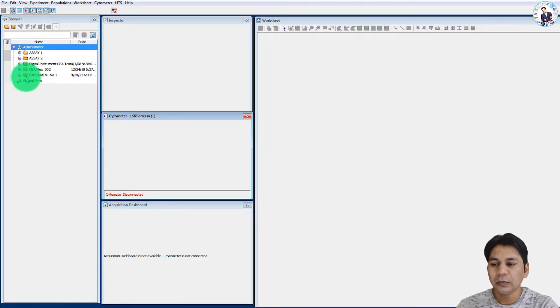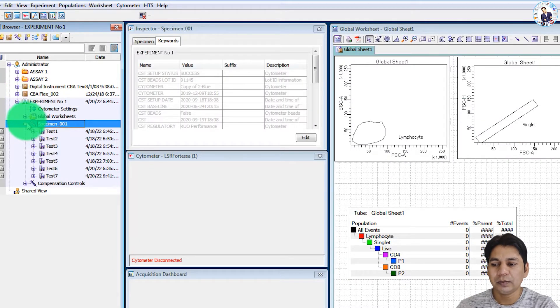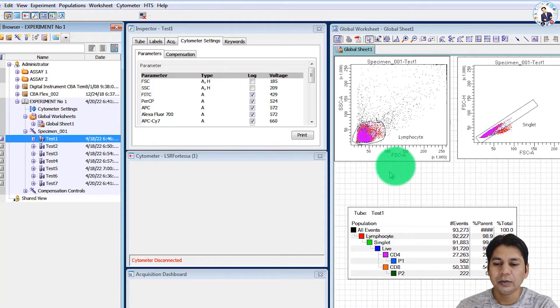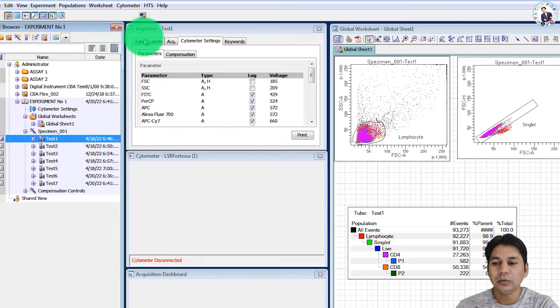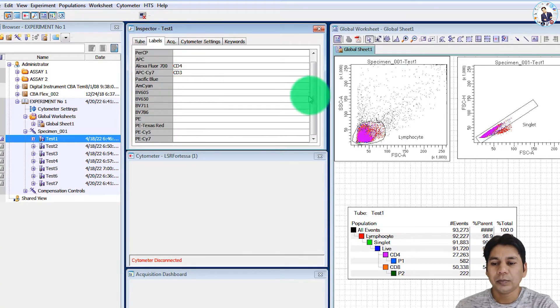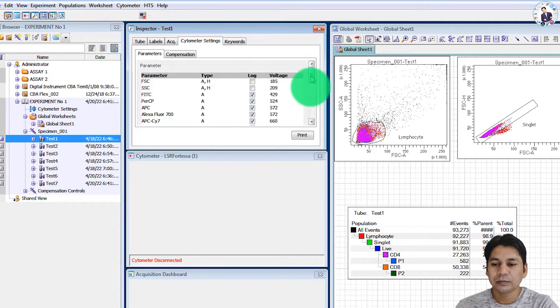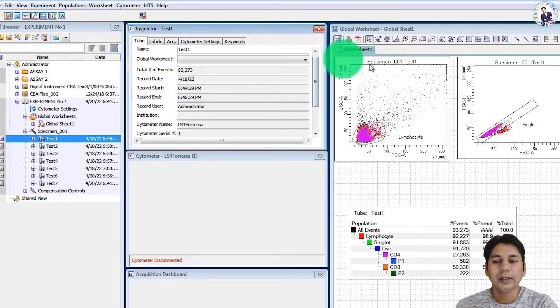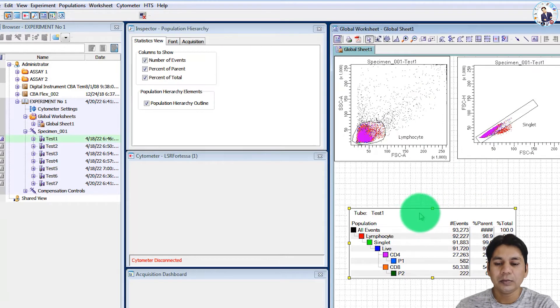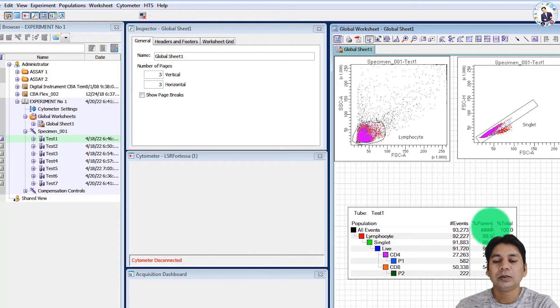Here I am going to open experiment number one — click here on the plus button. If you click on file test one, you can see the details of this file. If you click on the tube inspector, you can see the tube-level detail of all the panels, acquisition detail, cytometer setting detail, and keywords. At the global worksheet you can see the gating strategy and the population hierarchy.